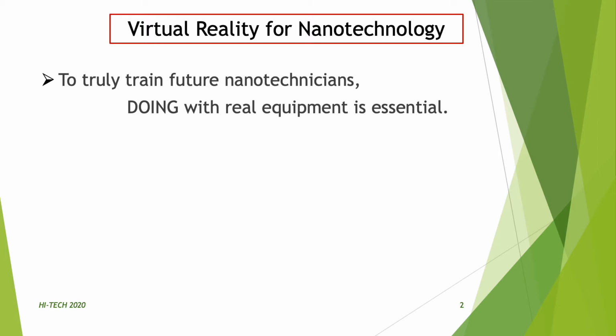While there is a fun aspect to these games, they are all created with the purpose of improving the laboratory training for students. Note that they do not replace the labs. Rather, as you will see, we use them as pre-training in preparation for working with the real equipment. The actual hands-on experience in the real laboratory is indispensable for the students.